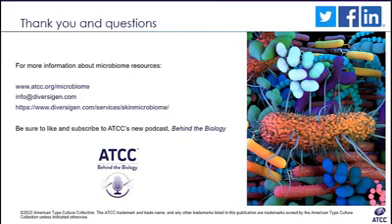Okay. Now, you mentioned background signal when you were answering the last question, so I'm going to jump to this next question since it's sort of related. What level of background signal, if any, is present when processing a blank or negative control sample from start to finish? Yeah, that's a very good point. And let me talk a little bit more about the blank controls, because I really didn't talk about them too much.